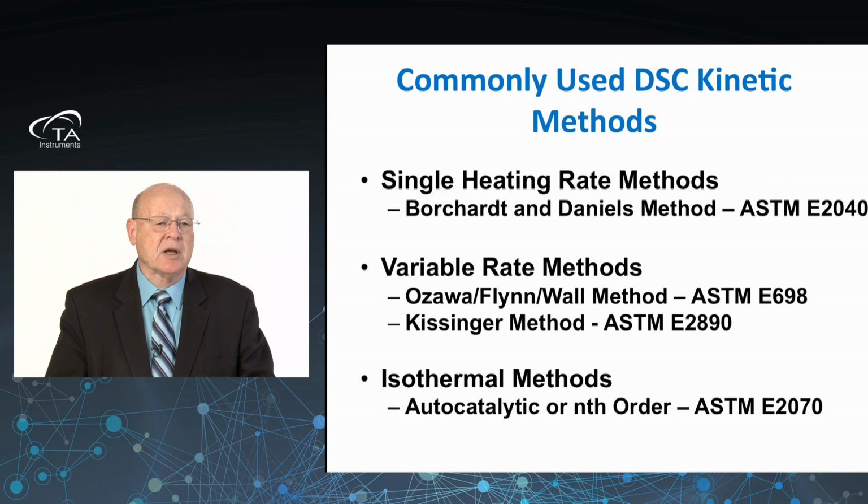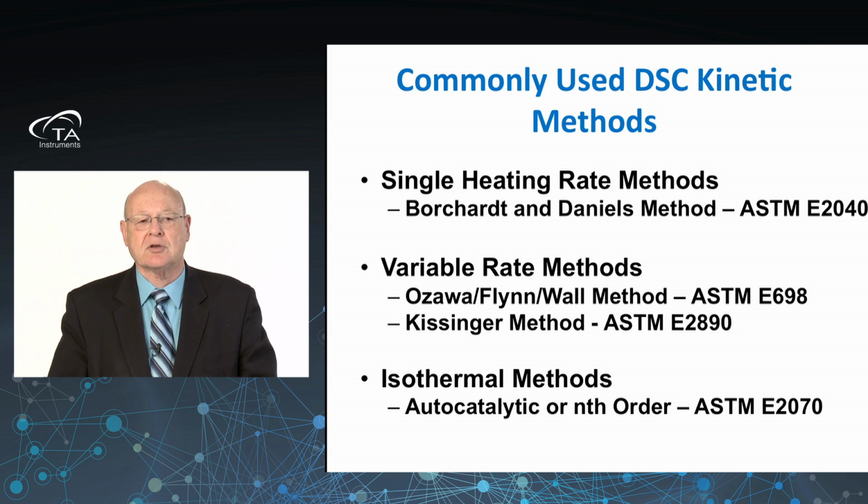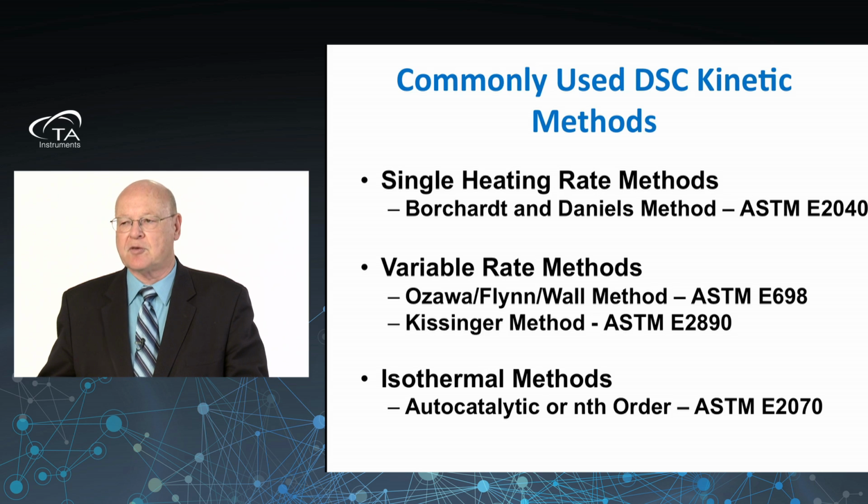Now, I give you these references to the ASTM standards because if one goes back to the original articles by the respective authors, they often are cumbersome with regard to mathematical derivations and demonstration of applications. The ASTM standards give us a specific way and set of instructions that help us make the determination, and they are probably the first place that you as the user ought to go for your information.